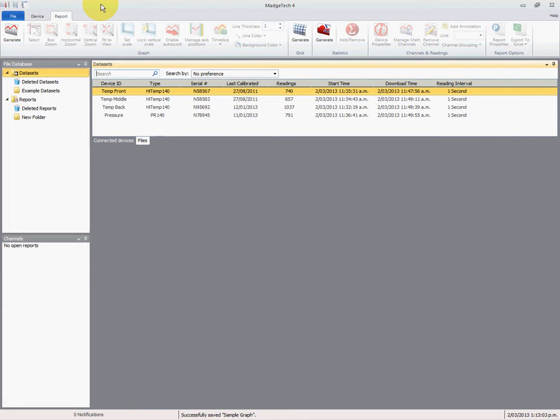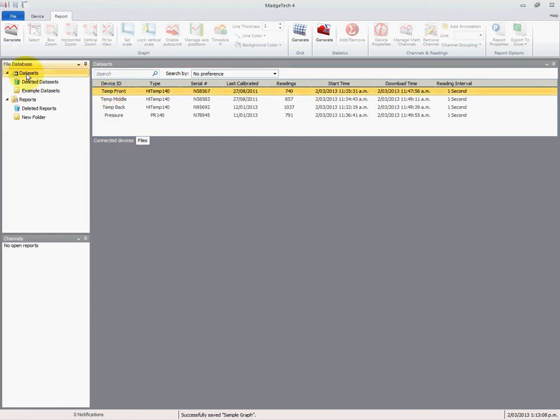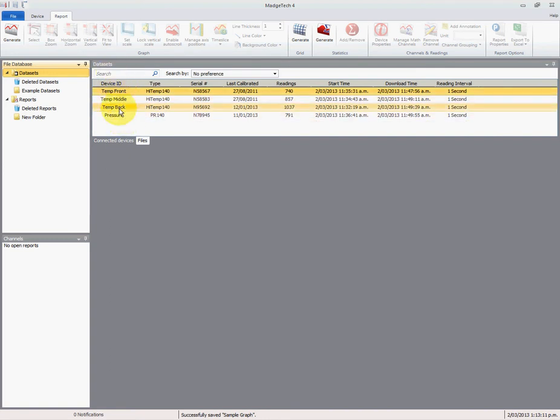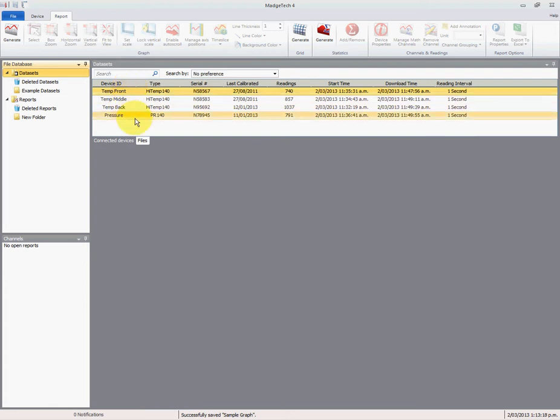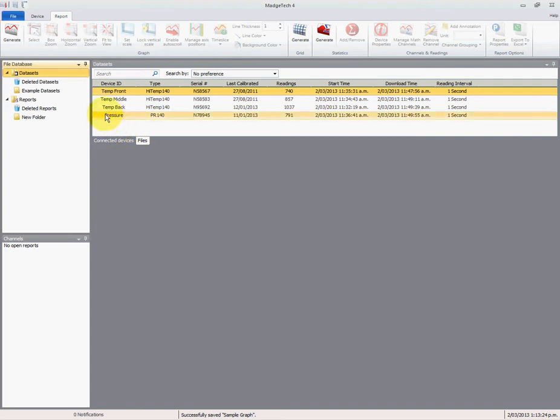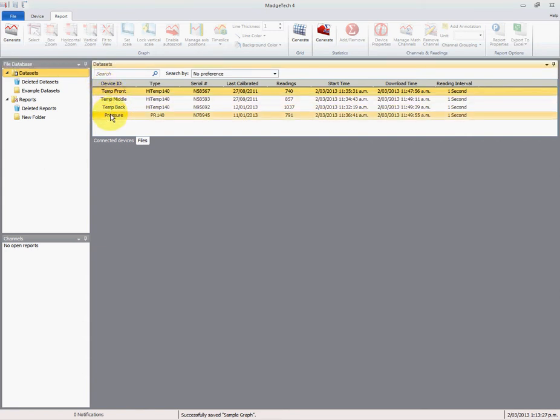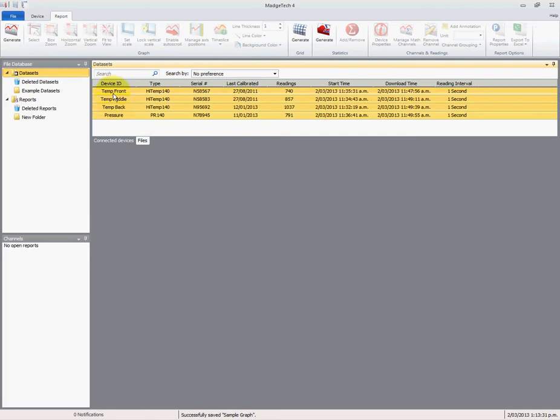If we click under the file menu here, click on data sets, we've got these four data sets that we can select from. If we've got more data in our internal database, we'd obviously have more data sets available, so we need to only select the ones that are applicable to us. In this instance, it's all of them, so we can select the first one, hold the shift key down, and select the final one, and all of them will be selected.